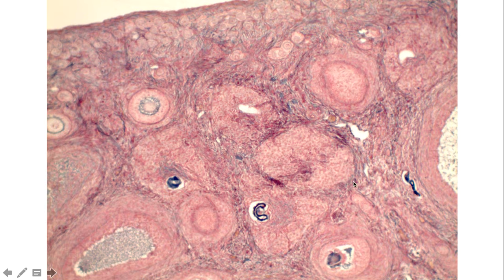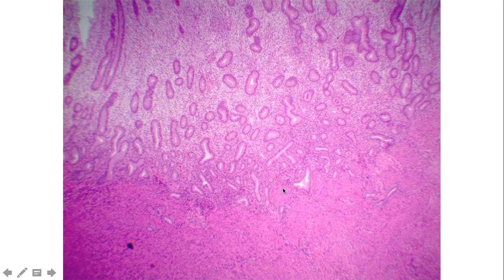These tend to be these large, almost kind of, they resemble in a sense these mucus glands. They have these large cells that almost look kind of frothy in a sense. These are the corpus luteum, and these are these follicles that follow ovulation, and these are going to be very important at secreting some of the sex hormones that will then influence the uterine cycle that we'll talk about in lecture. And so the last one here, the corpus luteum.